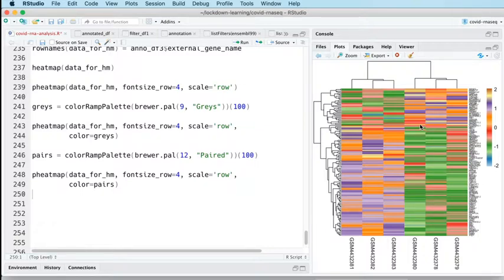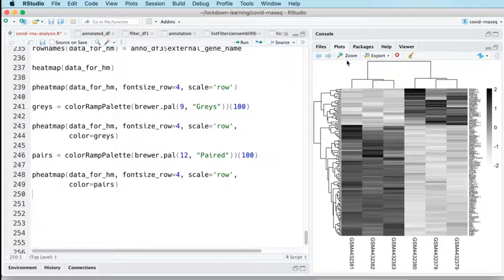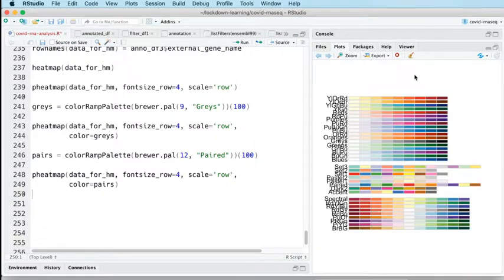Weirdly, that's not hugely different from the kind of spectral color schemes that things like MATLAB use by default. That's a similarly insane color scheme. So yeah, that's crazy. Let's undo that, shall we? Let's do one final one just to settle on something that's not completely insane.